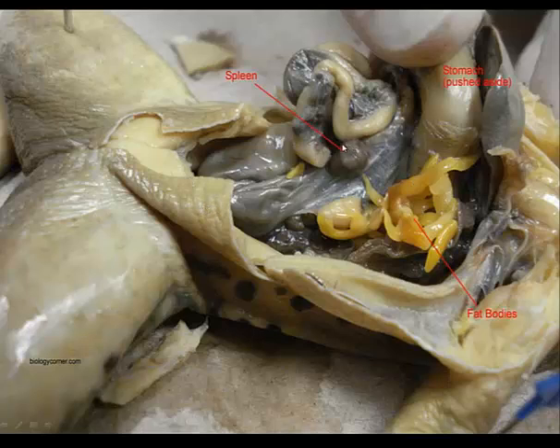The spleen is a small spherical object, brown because it is responsible for holding blood. It's going to be in the mesentery of the small intestine. We lift up the stomach to see the mesentery holding together the ileum of the small intestine — that's where we'll find our spleen.